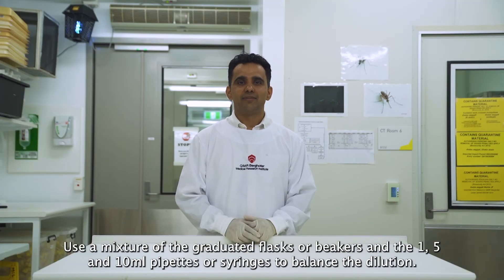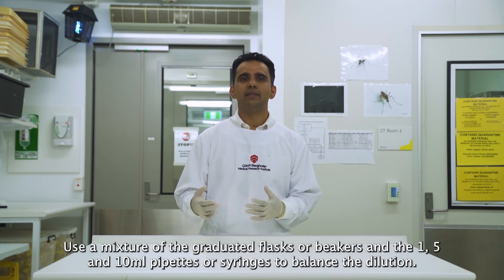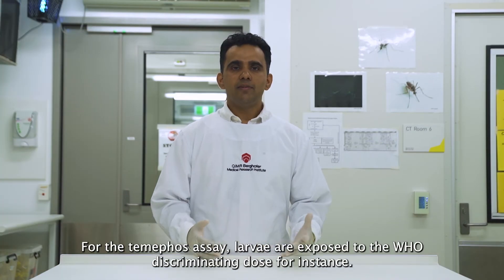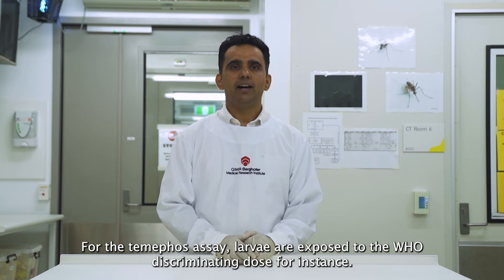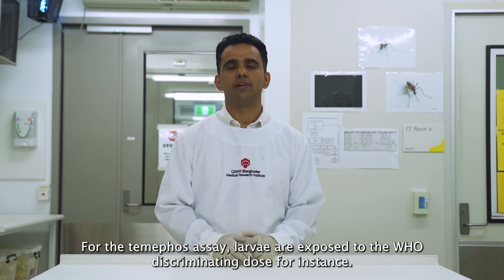Use a mixture of the graduated flask or beakers and the 1, 5, and 10 ml pipettes or syringes to balance the dilution. For the Temephos assay, larvae are exposed to the WHO discriminating dose for instance.